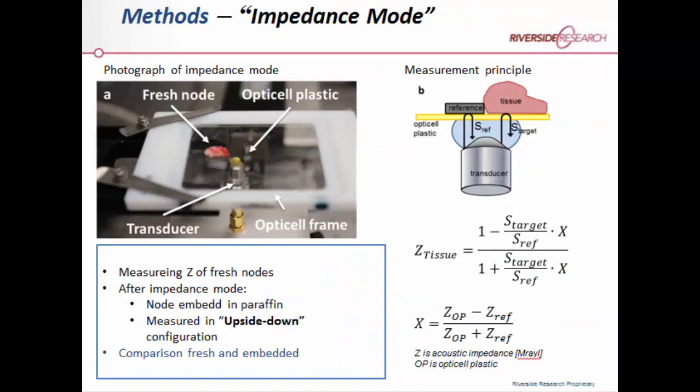But the impedance mode, I thought I was going to be the first one to talk about this, but again, the previous speaker explained that quite nicely. We're doing it at much higher frequency, but the principle is the same. We can actually not use that substrate. We're using an OptiCell plastic, which allows the wave to propagate. But the principle is the same.